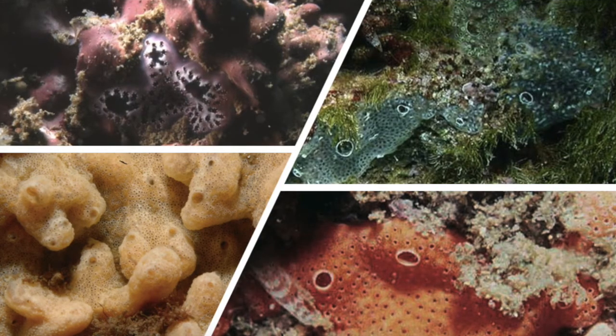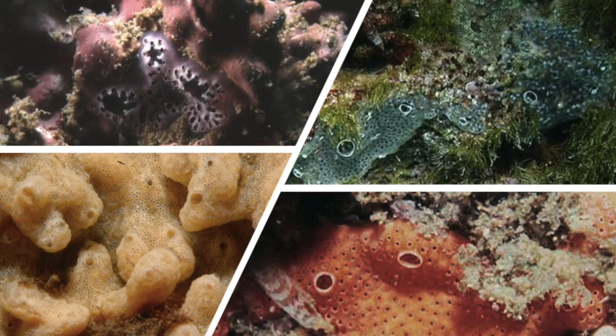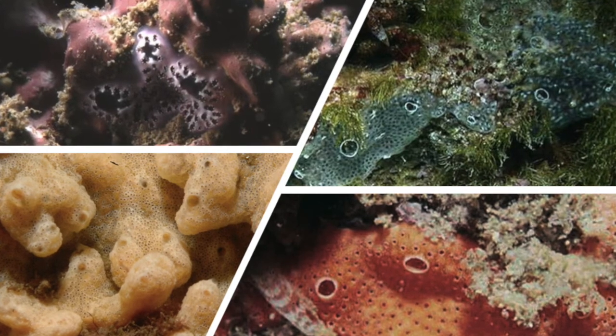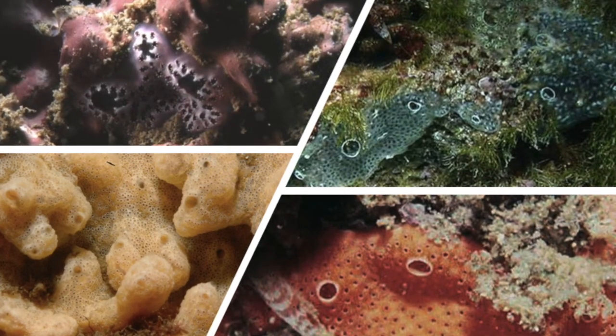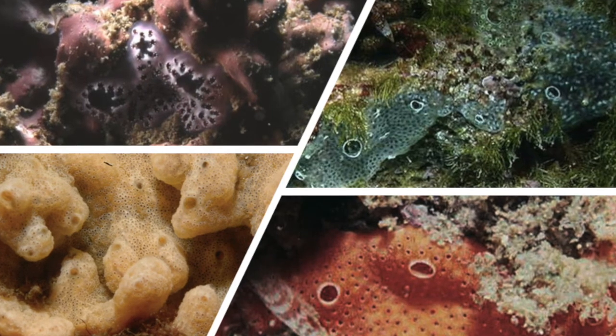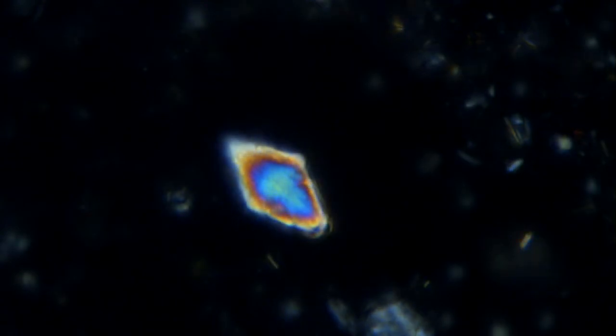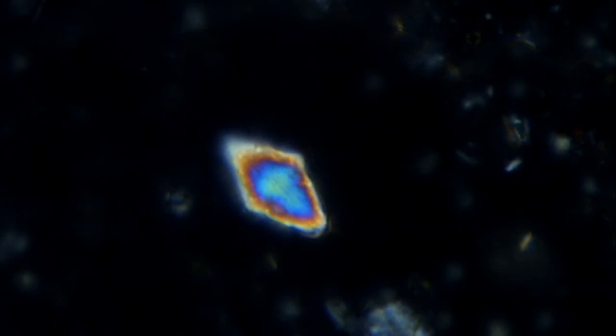Ascidians are benthic colonies of very small animals that inhabit shallow coastal environments, from which come most of my samples, but you probably will not see them much if you study open marine deep ocean samples. You'll remember that we have already mentioned that these spicules are made of aragonite, a polymorph of calcium carbonate distinct from calcite, but for this purpose behave the same way. These colors result from the interference between the extraordinary and ordinary rays that emerge from the crystal.